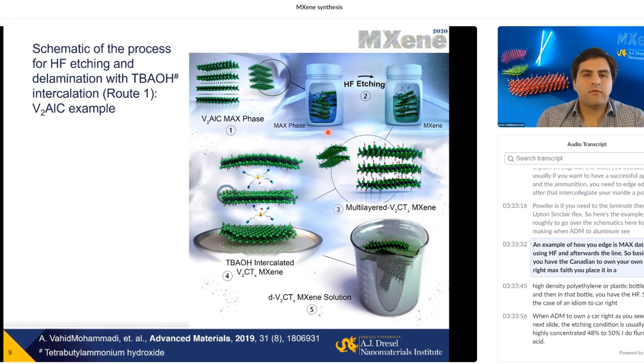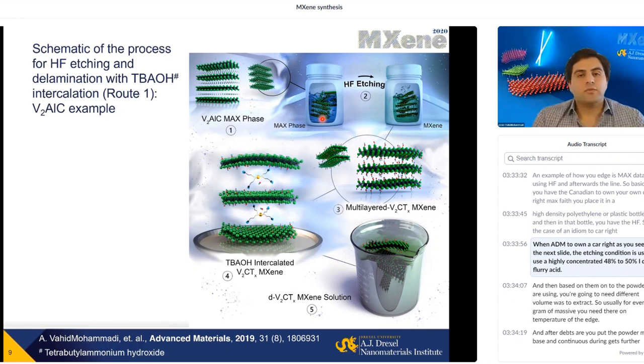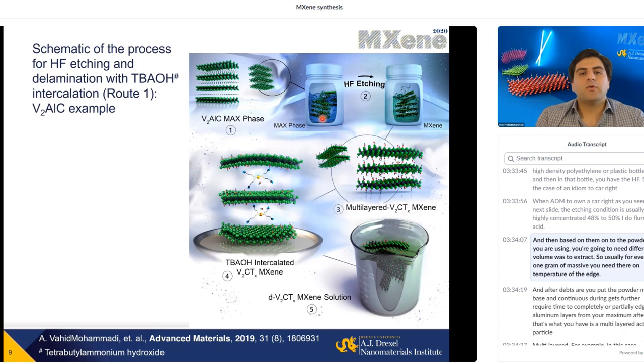You have the vanadium aluminum carbide MAX phase. You place it in a high-density polyethylene or plastic bottle. And then in that bottle, you have the HF. So for the case of vanadium carbide, from vanadium aluminum carbide, as we will see in the next slide, the etching condition is usually a highly concentrated 48% to 50% hydrofluoric acid. And then based on the amount of the powder you are using, you are going to need different volumes of the etchant. So usually for every 1 gram of MAX phase, you need around 10 milliliters of the etchant.